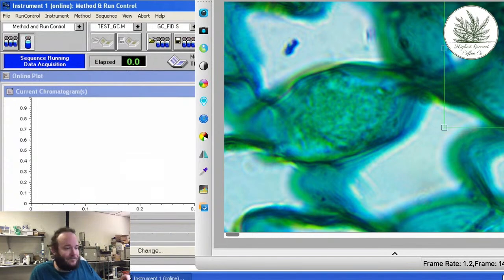So every micro movement, up, down, or sideways, especially up, down, changes what you see and what you can see, right? That's why sometimes I see the dust on top of the glass, and I got to change my focus to focus deeper to look at what's underneath the glass, as an example. So the same thing is happening for cells.